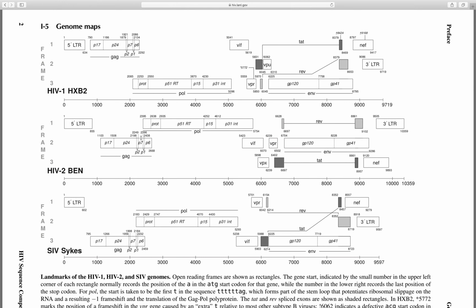This similar information is available in the HIV database website by itself, but this is a much more useful way of looking at this information, because it also puts it in the context of some other very closely related retroviruses. So, for example, we have HIV-1, whose reference genome is HXB2, and this is just one of the first HIV sequences to be publicly recognized. There were some other sequences, remember, that we saw from the 70s, but those weren't necessarily available for early studies. So HXB2 was the first one that people have been using up until very recently.